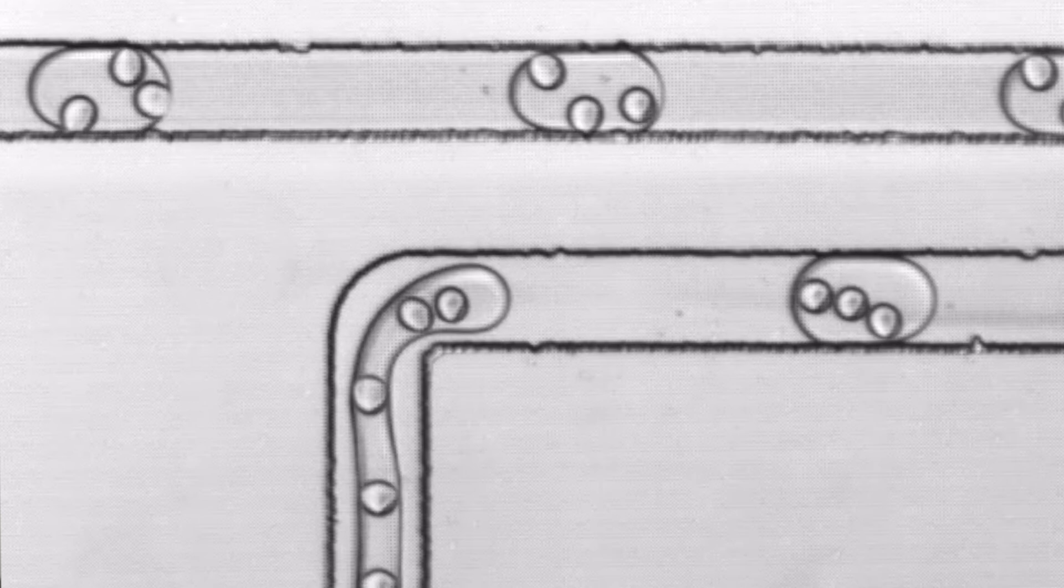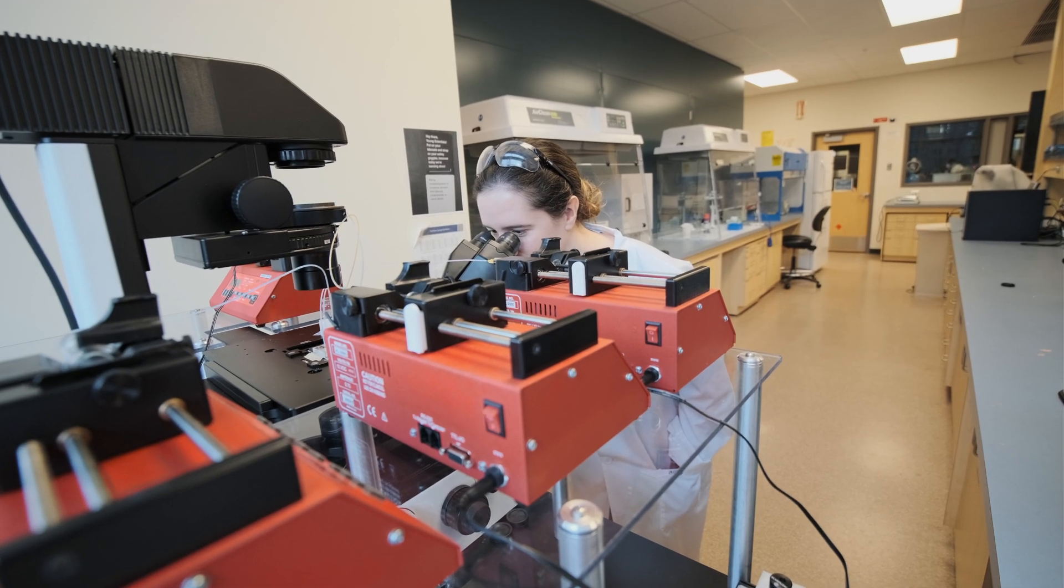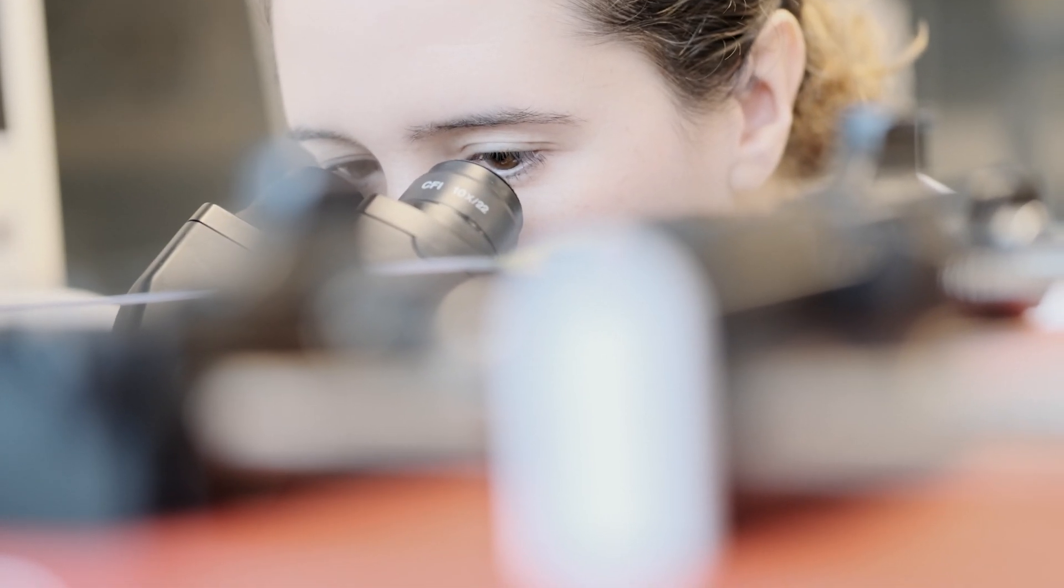What we do is we build artificial cells on a chip, so we are very interested in the cell membrane. The cell membrane is kind of the skin of the cell. It covers the cell and allows the cell to communicate with the outside world. We build these artificial cells by building the cell membrane on these chips and using that to look at how drugs get into cells.